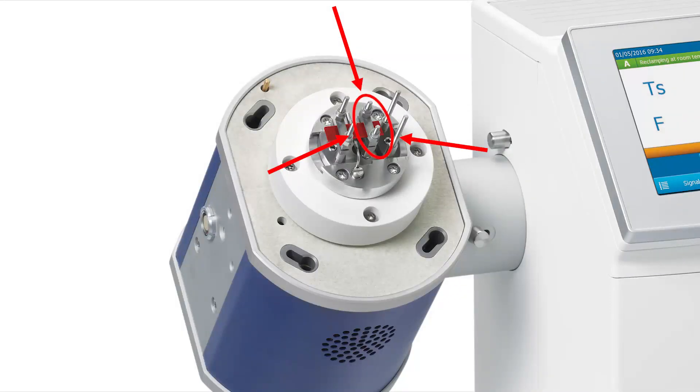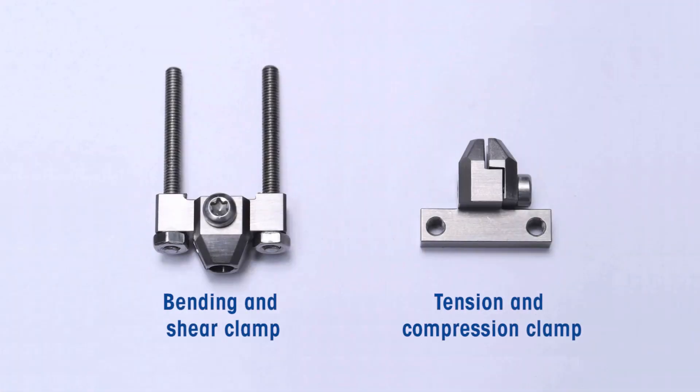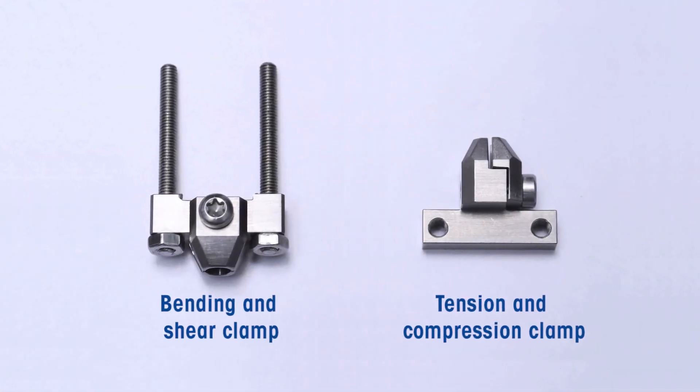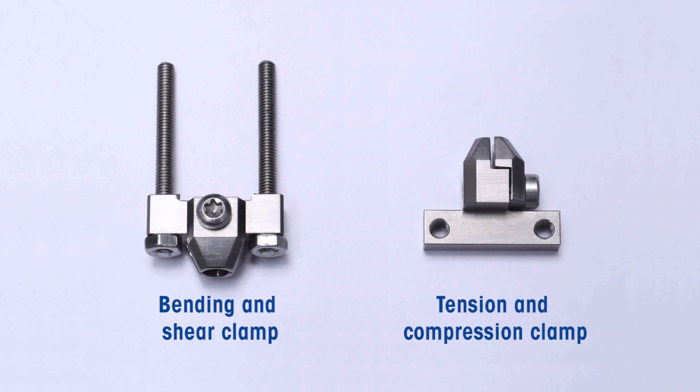The drive shaft clamps must be changed when switching between different modes. Different drive shaft clamps are available for bending and shear or tension and compression modes.